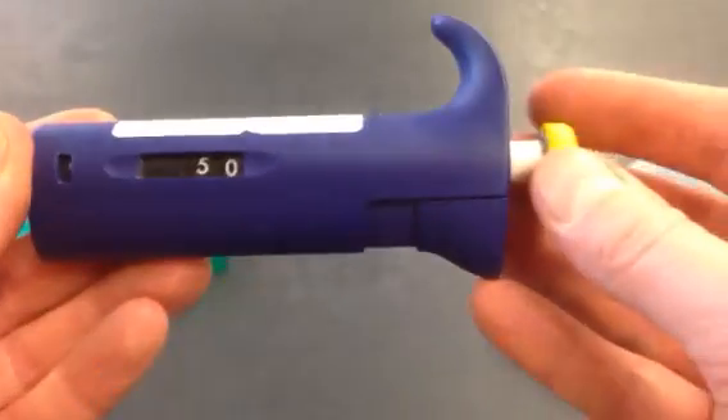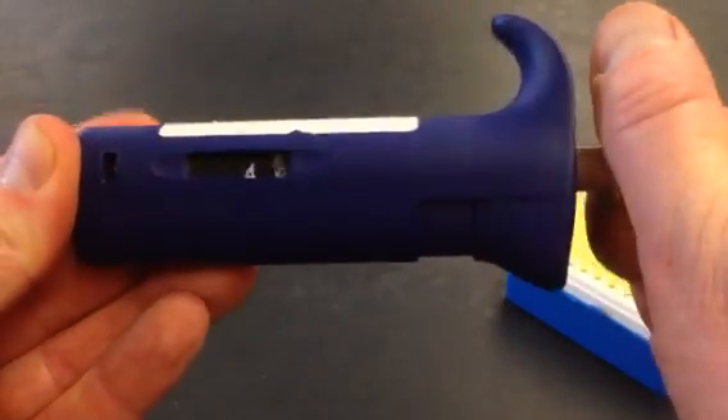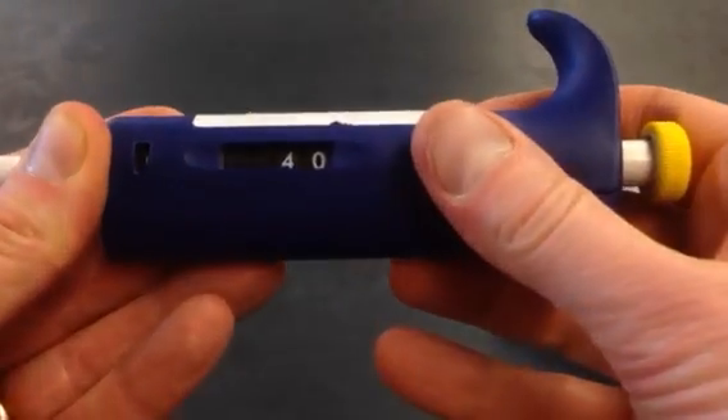This little window on the side shows me what volume we're set to measure right now. It's currently set to 50, so I just need to turn this to adjust it to 40. Make sure you always check that.